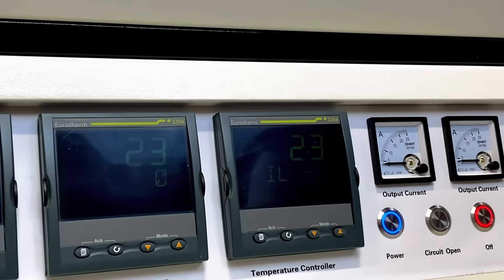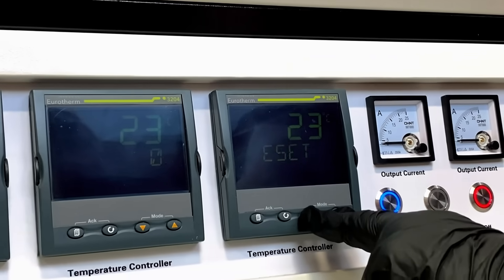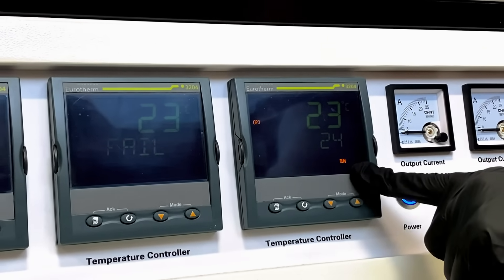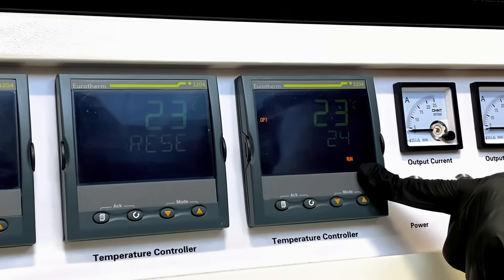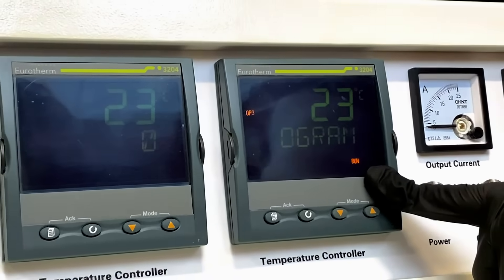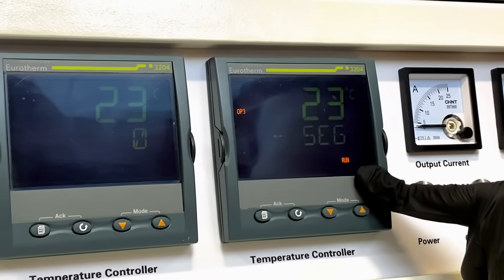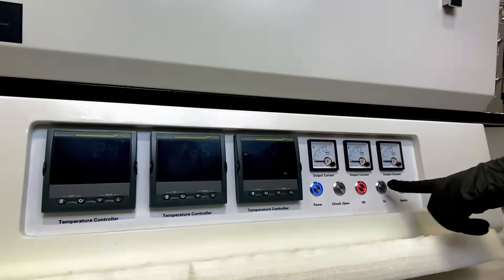And then, to power on the furnace and run your temperature cycle, you are going to want to press the up and down button at the same time. See how it is turned on the run button? Don't worry. You may play with your temperature controllers and their parameters until initiating the furnace, and then it will only begin heating once you press the on button.